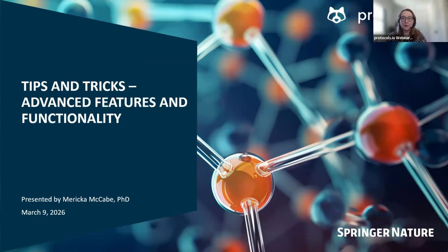My name is Mericka McCabe. I'm a scientific engagement manager with protocols.io. I'm based out of New York, and today I am going to be presenting our tips and tricks webinar on advanced features and functionality. This is more of an advanced webinar. I'll dive into some deeper functionalities that protocols.io has. For those of you who are new to the platform, please feel free to stay on. Just know that we'll be skipping some of the basics that's covered in the introductory webinar, so you might want to go back later to watch that.